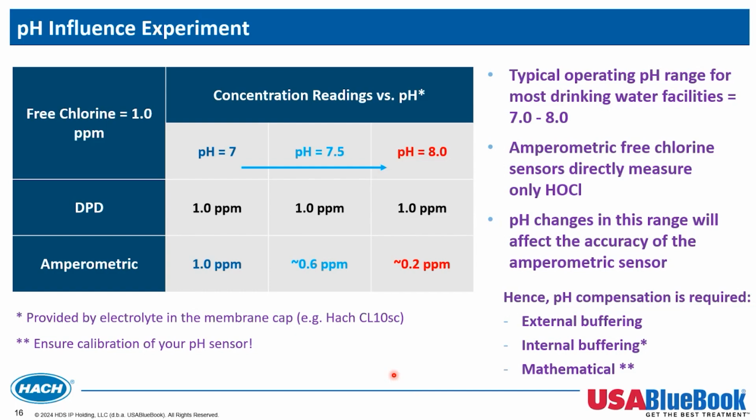Without a pH meter or pH sensor connected to it, it's just useless. And with a pH sensor, you need to think about that and ensure that pH calibration is correct. All those things do matter, and all those things come from the application. So the application drives a lot of those nuances and very important parts of choosing the right analyzer, right?